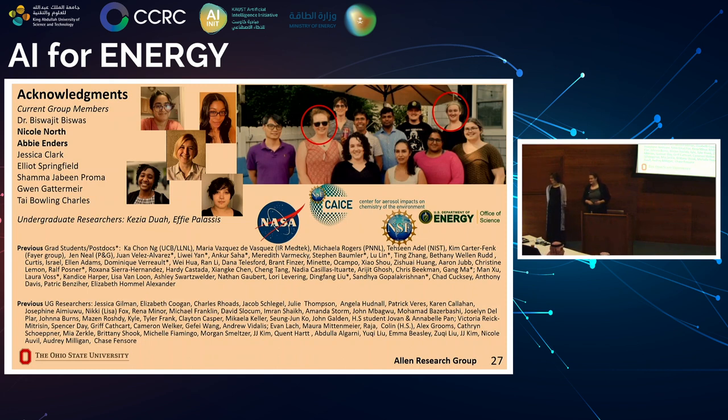Okay, thank you for a very nice talk. Just at the end, you talked about using these methods for sensing maybe oil leaks or whatnot. But the initial methods you described are looking just at the surface, right? So maybe just the top few millimeters. You can't penetrate. So if this sort of mixing is not represented in that top surface, then I guess it's difficult to see.